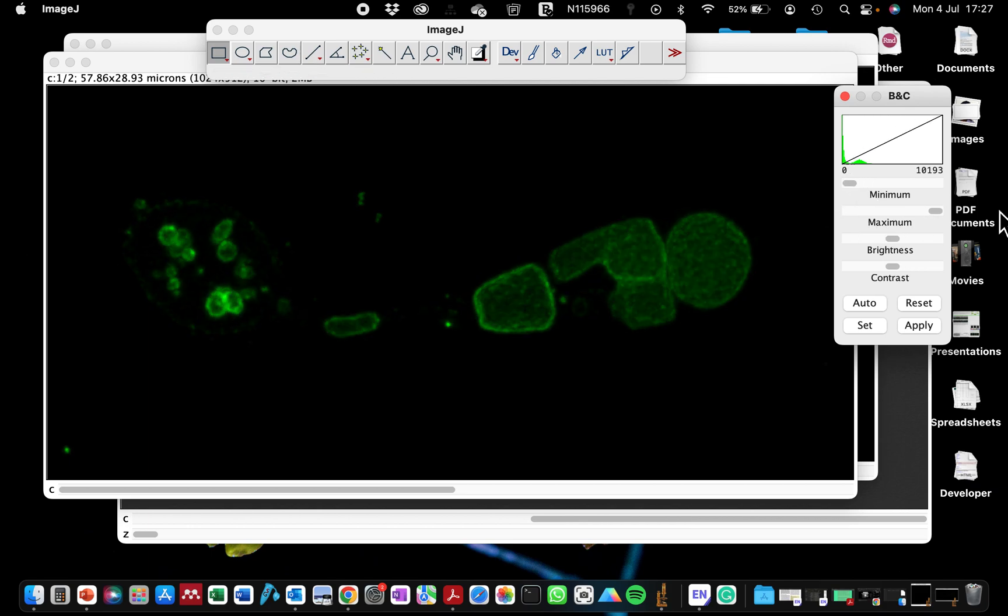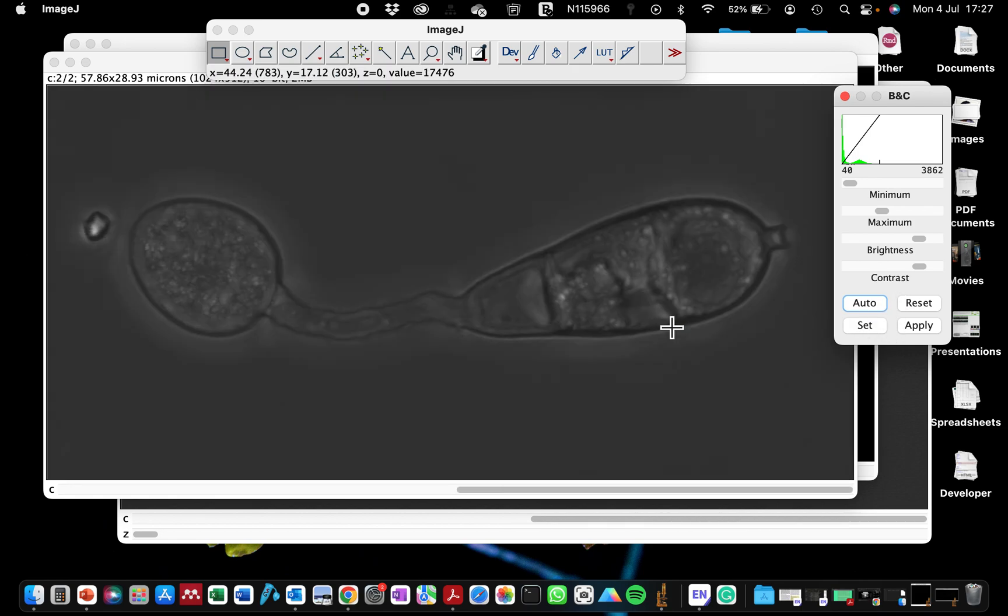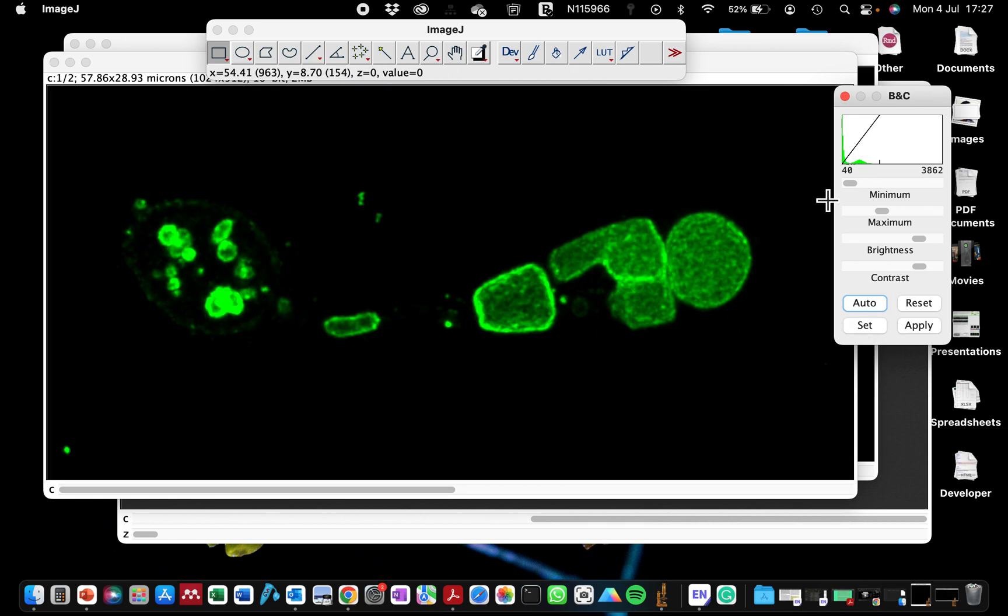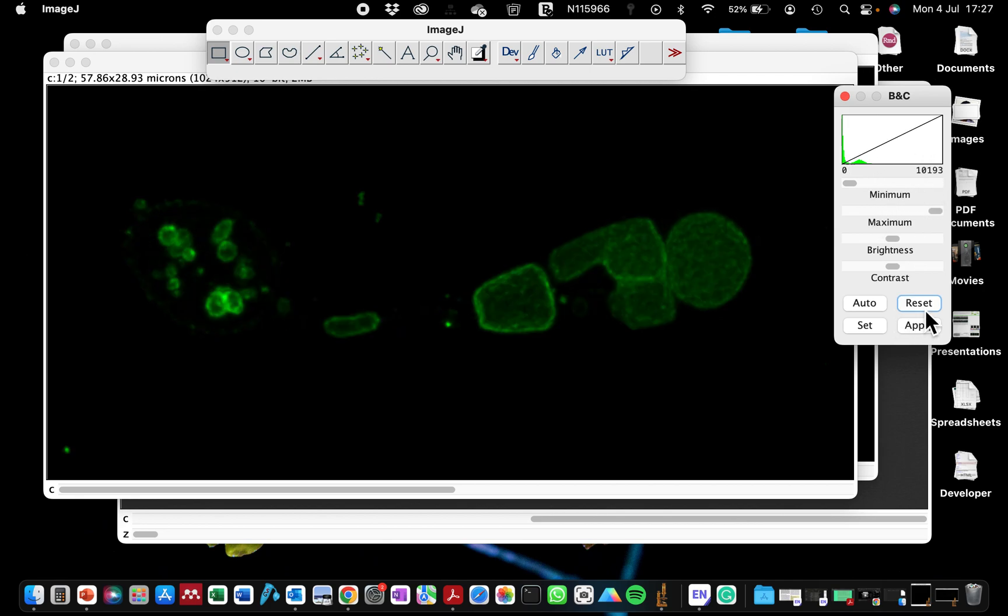And the second option is just to use the reset function or just use the auto. So if you're using the auto function, remember to use that function across all your images so that it's reproducible. And for me, I usually try to play with a specific number of pixels.